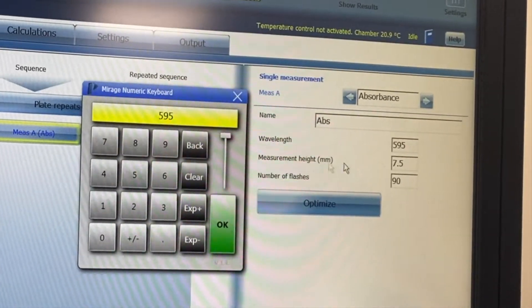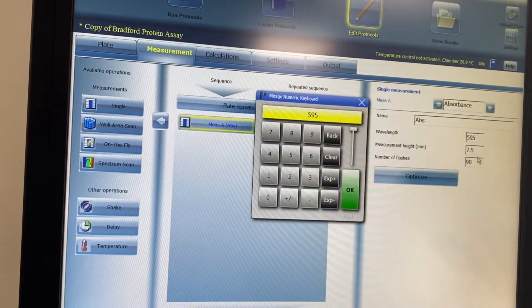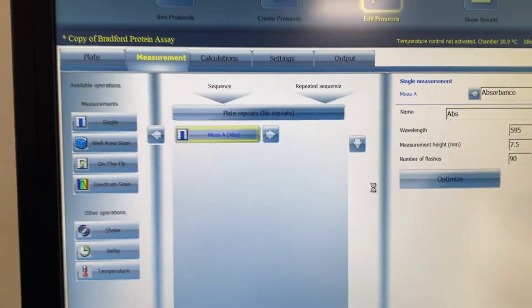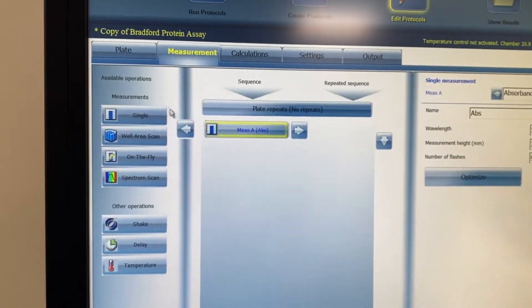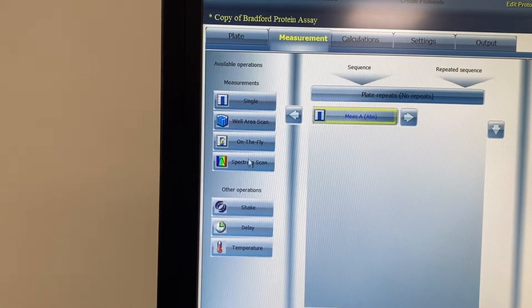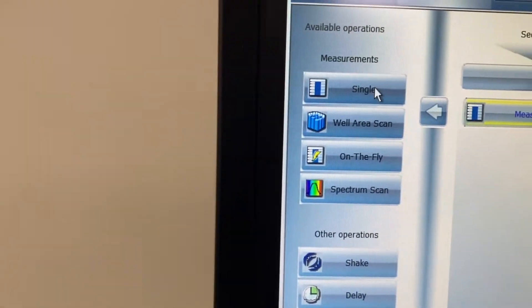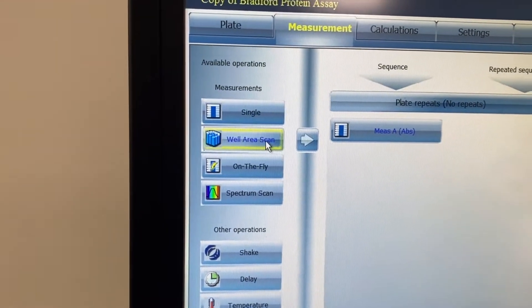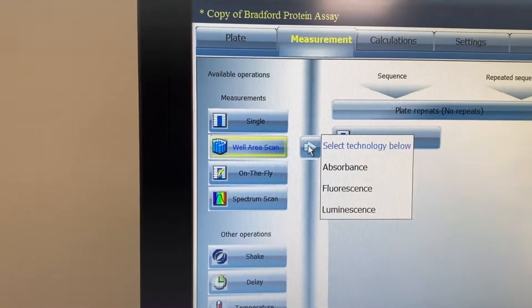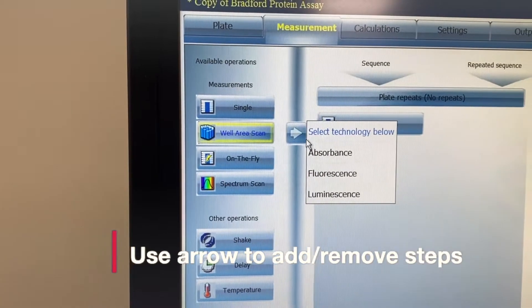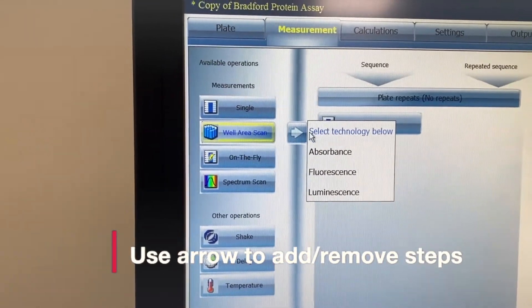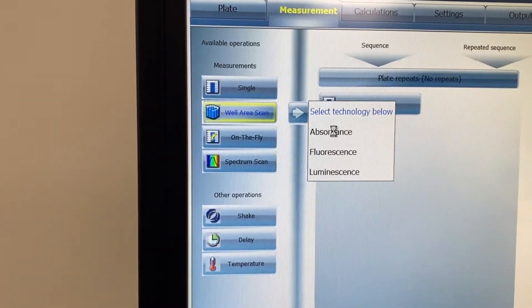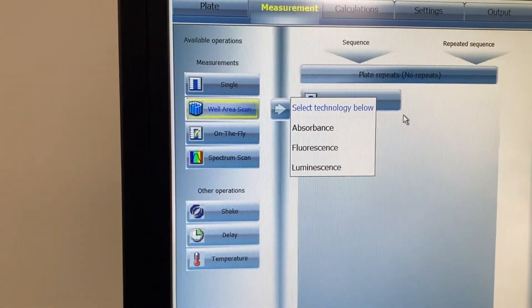If you're doing 405 nanometers, here you can change the wavelength that you want to measure. These are the heights of the plates you'll be using — you can usually leave it on the default unless you're using a specialized plate. Then you can select the kind of reads that you want: you can do a single read, but if you want a well scan you need to bring it over by pressing this button, and you can specify that it's an absorbance read.